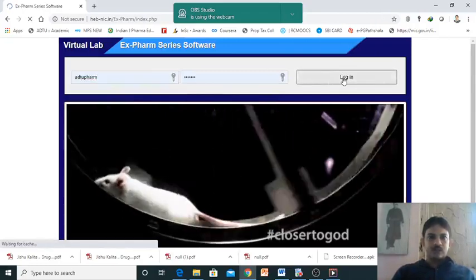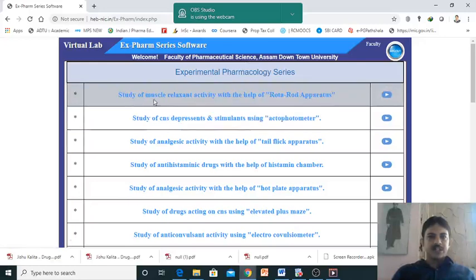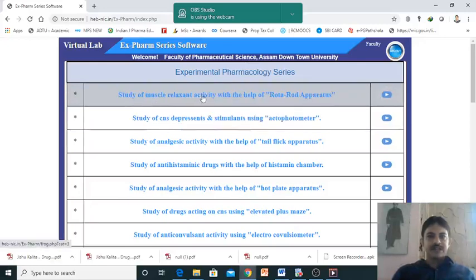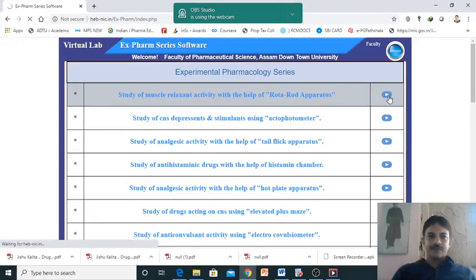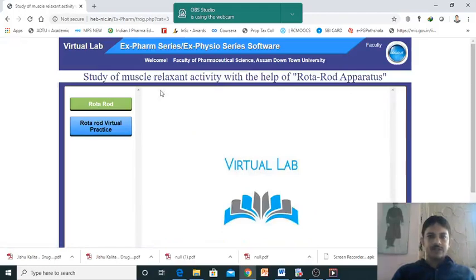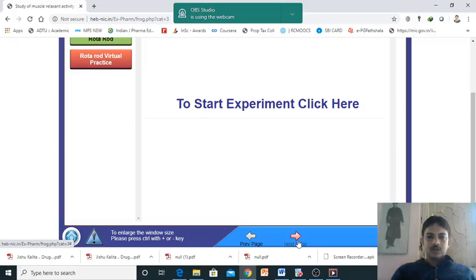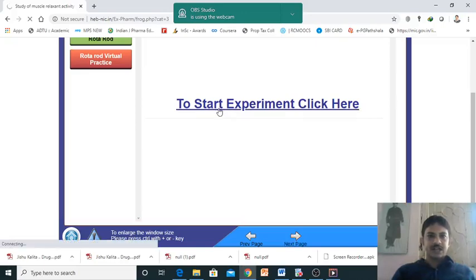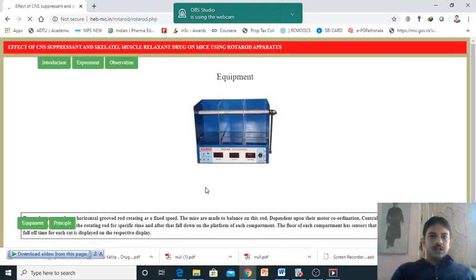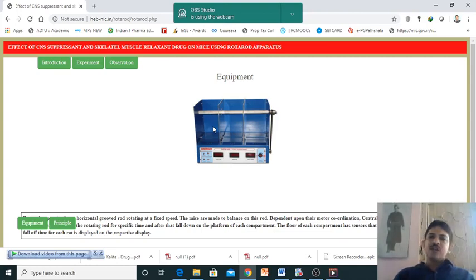First experiment: study of muscle relaxant activity with the help of rotor rod apparatus. Click here to start the experiment. This equipment you have already seen in our laboratory. This is the rotor rod apparatus with a rotating shaft. The speed can be controlled - generally we maintain 22-25 RPM. We keep the animal on this rotating shaft and animals try to balance themselves on the rotating shaft.